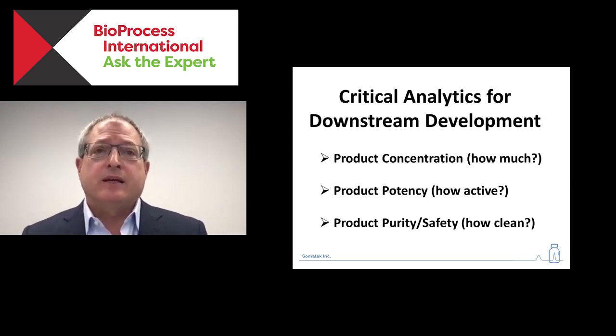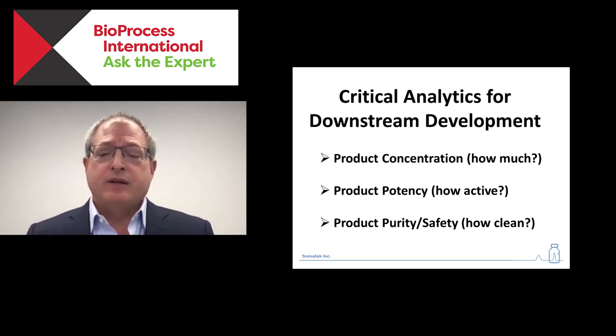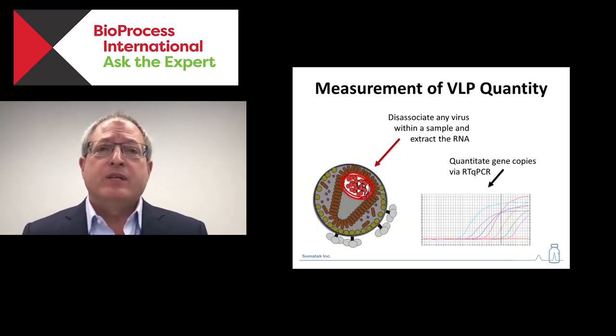And then lastly, purity and safety concerns. And I'll touch on each of these briefly. For this particular process development, we relied heavily on a qPCR assay.